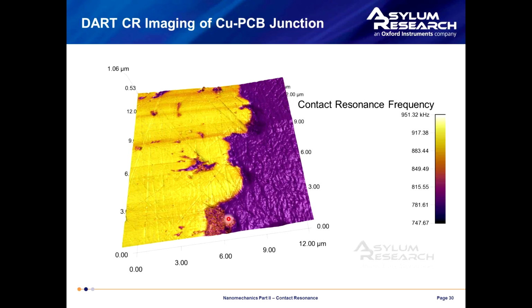There's also an interesting little inclusion here, which is some sort of, well, we don't know what it is, some sort of impurity or something else that's in between these two materials, at about 850 kilohertz.